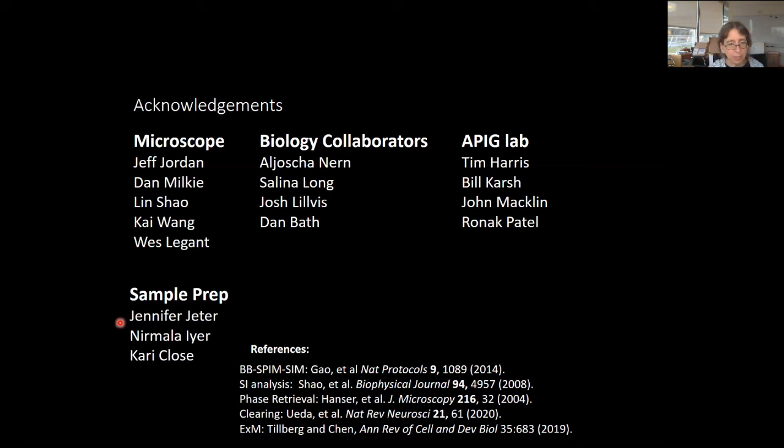There's a version of structured illumination working with confocal in the Airy scan that Zeiss builds. If you're just collecting your light in a confocal microscope with a photomultiplier, you don't really have anything that can work like structured illumination.